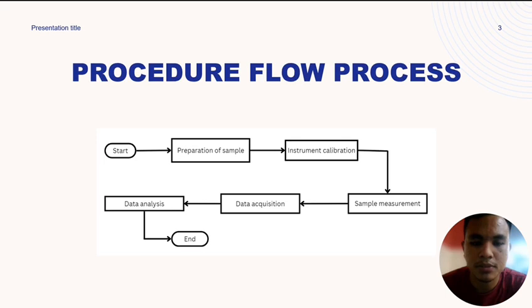I summarize that the procedure for all techniques is: start with preparing the sample, instrument calibration, sample measurement, data acquisition, and data analysis.